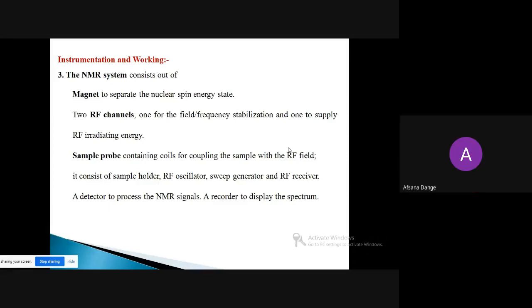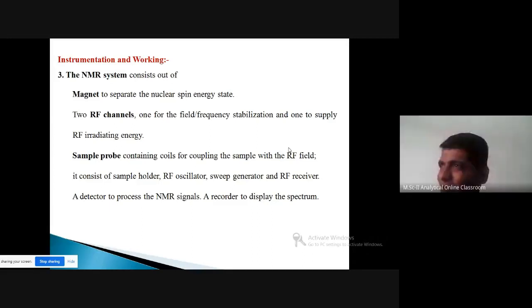ऑलवेज रिमेंबर पहिला सॅम्पल होल्डर. ओके गुड, सॅम्पल होल्डर. तुम्हाला एक आयडिया सांगतो, कुठले स्पेक्ट्रोस्कोपी करताना जर कोणी विचारलं इंस्ट्रुमेंट पार्ट कुठला आहे, तर पहिलं तुम्हाला लक्षात आलं पहिले की डिटेक्टर हा सगळ्यांमध्ये असणार आहे, बरोबर? तर पहिलं उत्तर लगेच आलं पाहिजे डिटेक्टर. इम्प्रेशन तुमचं चांगलं पडेल ना, हो ओके ही नोज अबाउट द पार्ट, मग बाकीचे सांगत जायचं. ठीक आहे, तो हा टेल मी अबाउट द डिफरंट इन्स्ट्रुमेंट पार्ट इन एनएमआर.